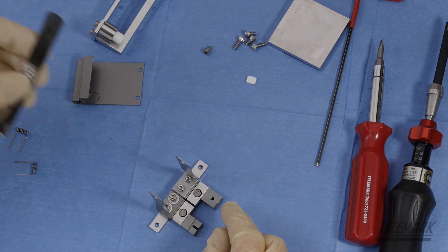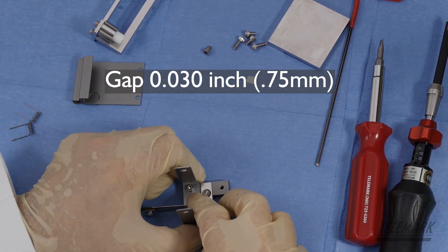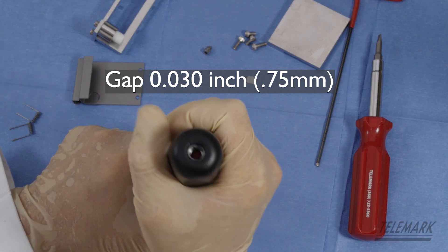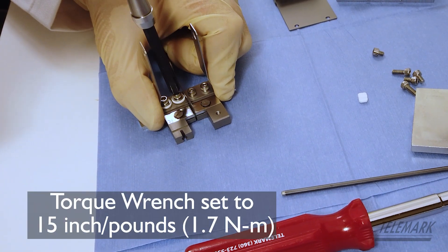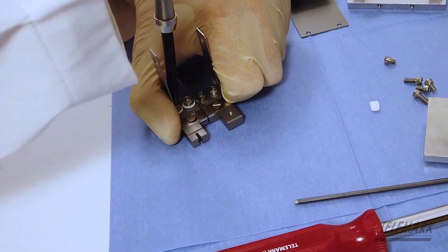They've got a feeler gauge here set for 30 thousandths. Get 30 thousandths gap between your two cathode blocks. Grab your torque wrench, which in this case is set to 15 inch pounds. Just snug them all down. Got them all snugged down.